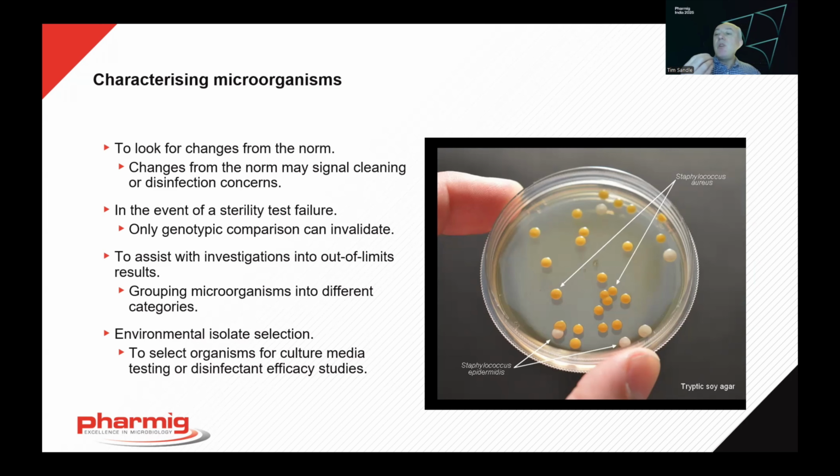And also reviewing that data helps us with doing things like selecting environmental isolates to challenge our culture media with, or to use for media fills. Remember, Annex 1 says that the media fill must have environmental isolates included in it. But also deciding what are the most appropriate organisms to use for disinfectant efficacy studies as well.